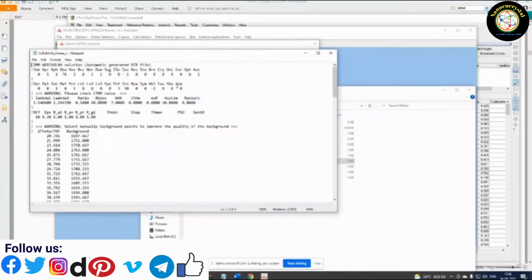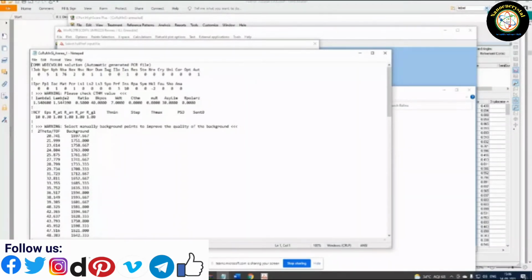Okay, so here you make sure that the radiation is copper radiation. So lambda 1 is 1.54 and lambda 2 is 1.5444, approximately. This you should make sure, and the ratio should be 0.5. This K alpha 1 to K alpha 2 intensity ratio is 0.5. So this you should make sure.